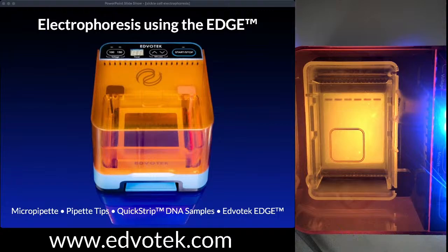You can see this even in a well-lit room, but it's nice to draw the lights down a little bit, especially to allow my camera to really see what's going on. Okay. If you have more questions about electrophoresis, make sure to put it in the form that Maria has posted here, or check out one of our other electrophoresis videos on YouTube.